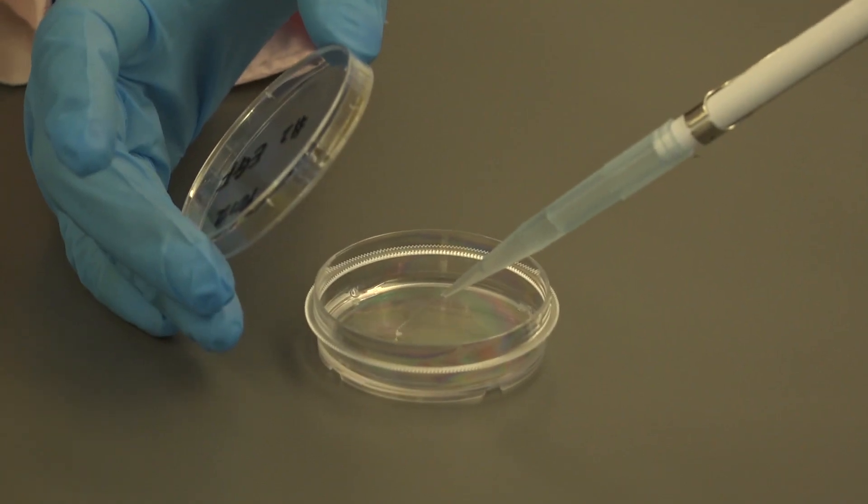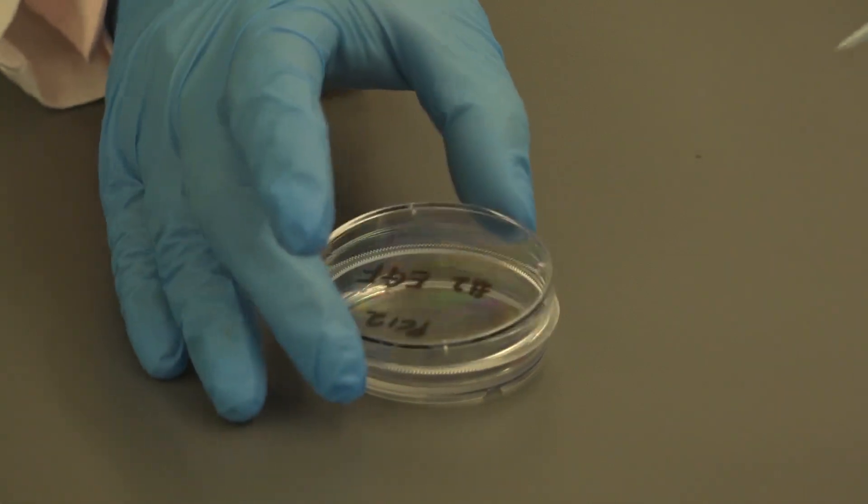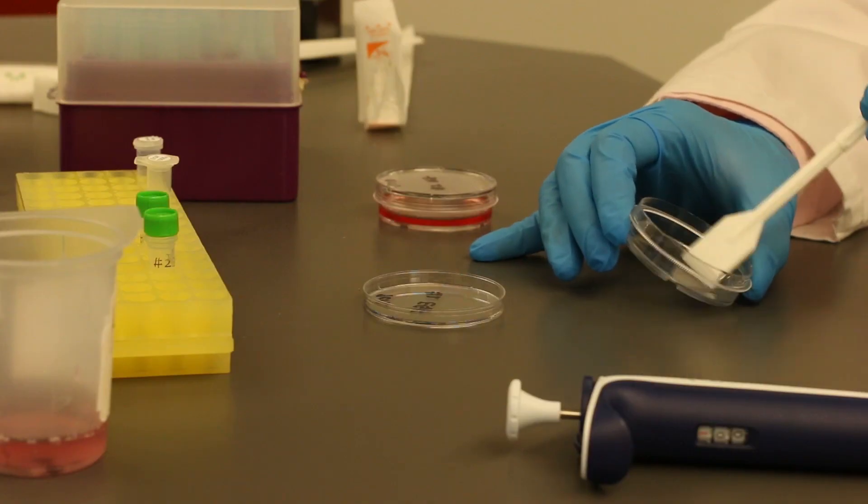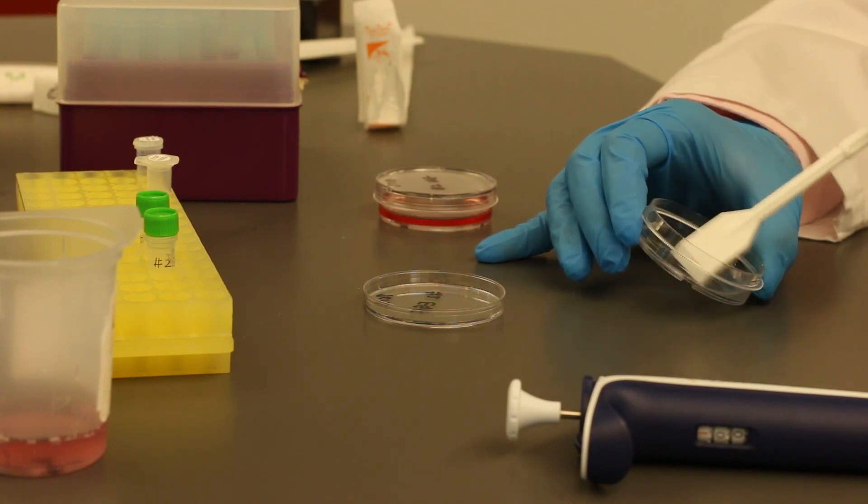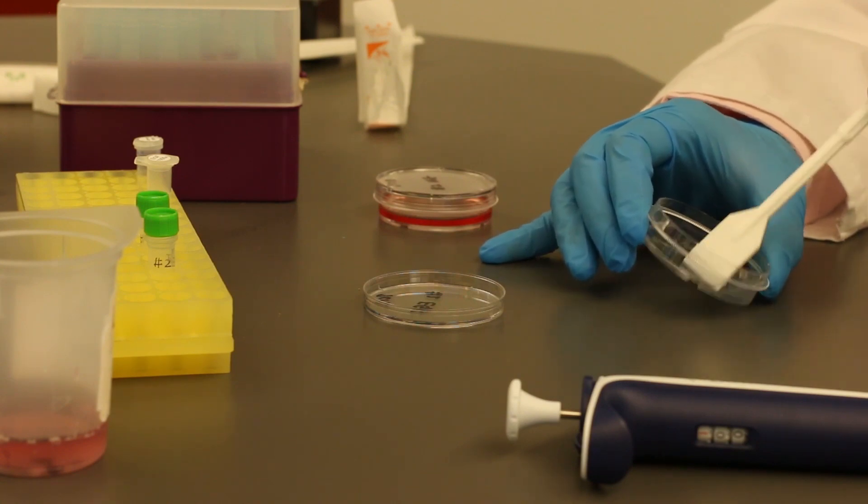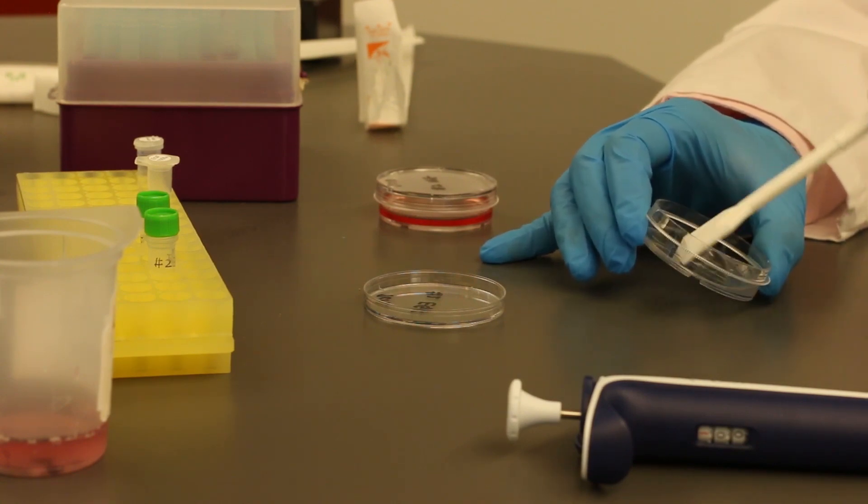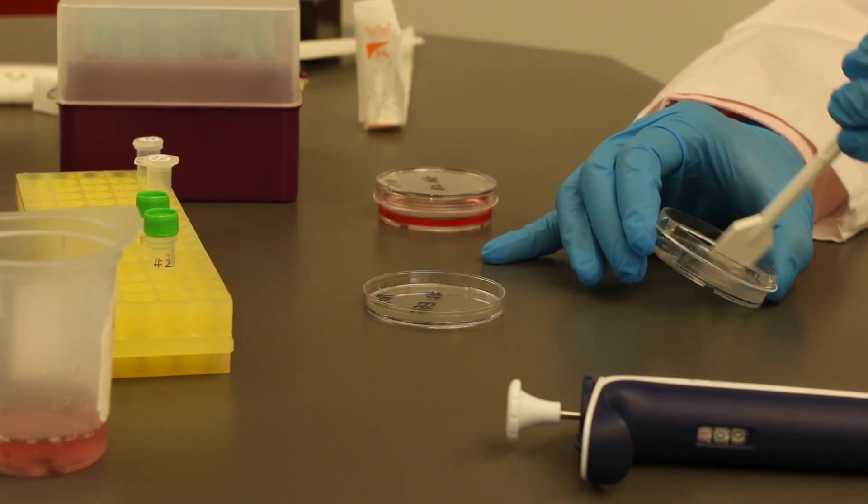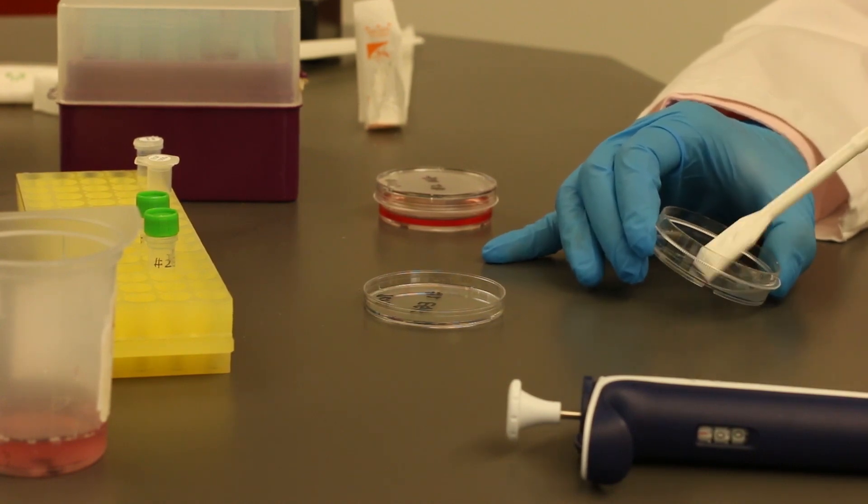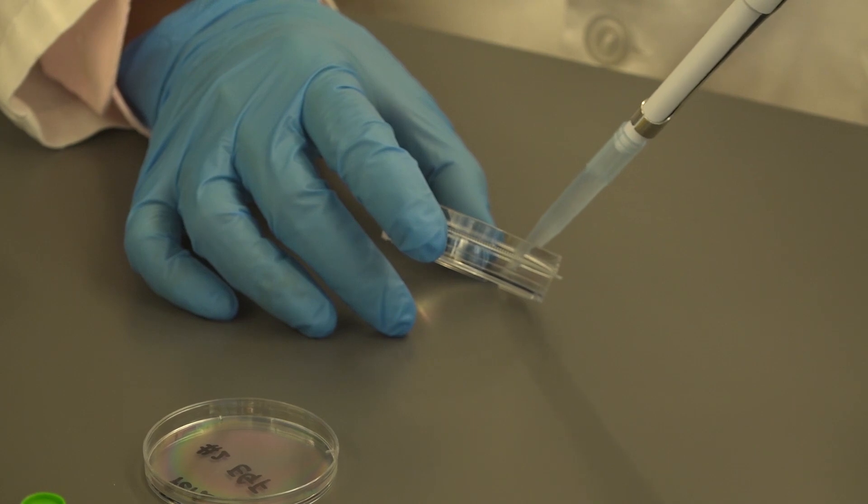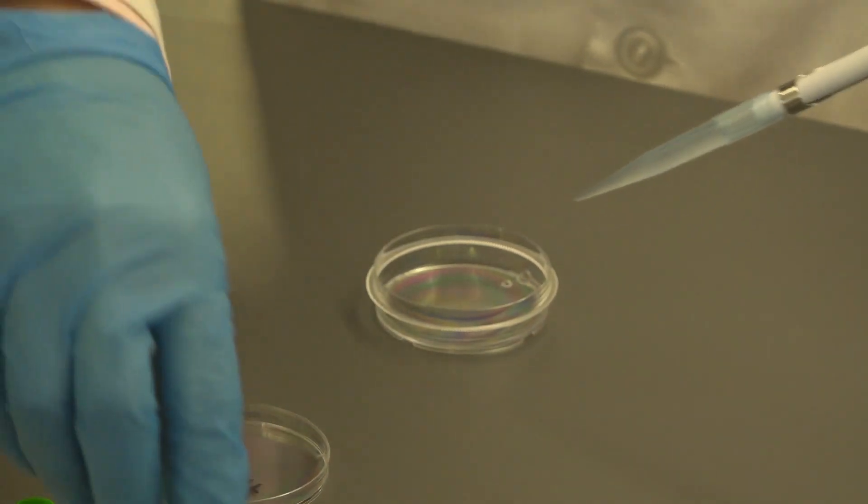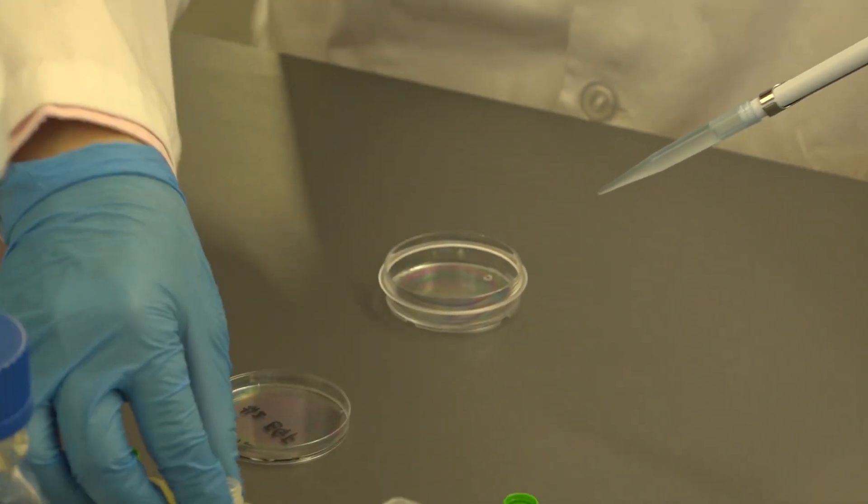Immediately pipette 1 milliliter of TBS into each dish and scrape off the cells using a sterile cell scraper. To make it easier to collect the cells, slightly tilt the dish and scrape all the cells into the bottom corner. And pipette all the cell suspensions into the pre-labeled 2-mil screw top tube.